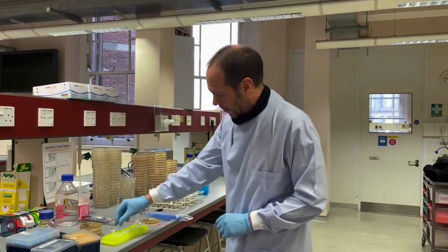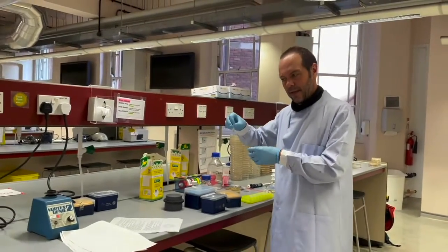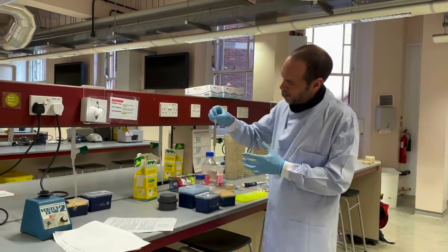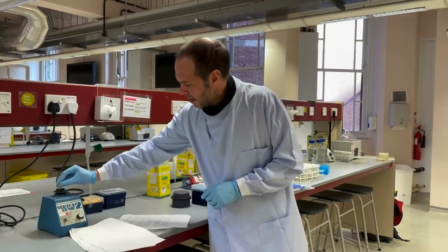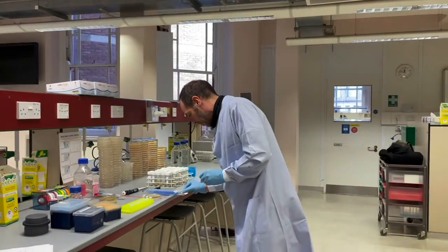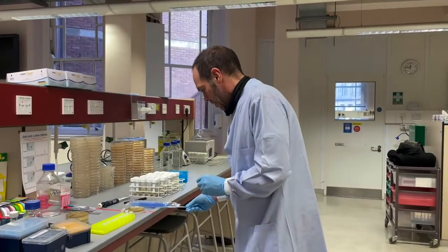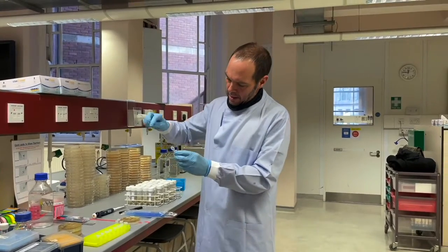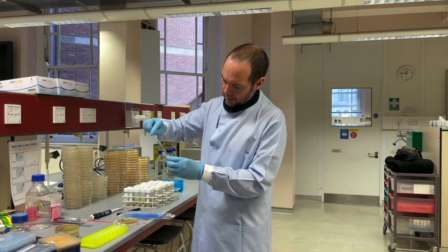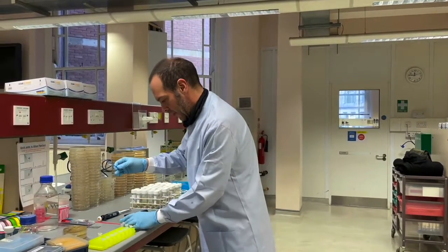Right, before I do that, I'm going to resuspend my cells. Now, this isn't quantitative dilution, so perhaps it doesn't matter too much, but I think it's going to work better if they're suspended in the liquid. Right, carefully extract one of these. What do you call these? Loops, inoculating loops maybe. Stick it in there. Right, it's now got lots of cell suspension on.